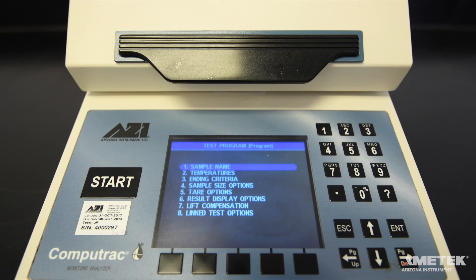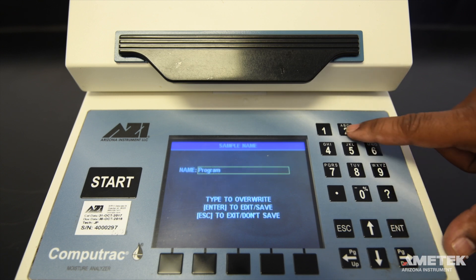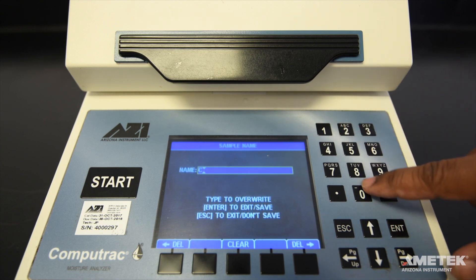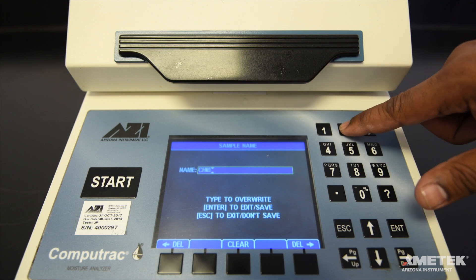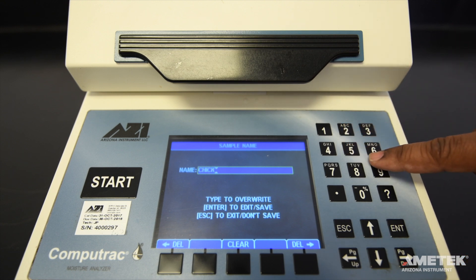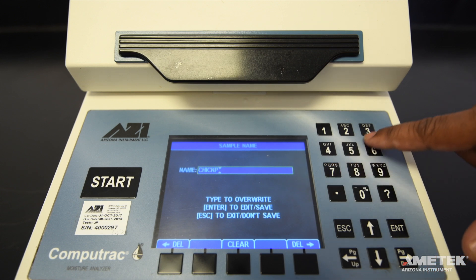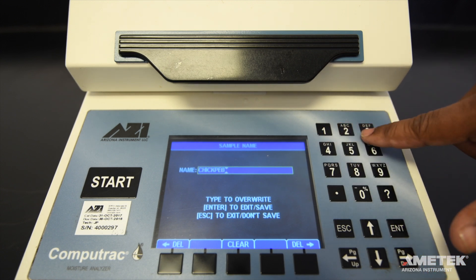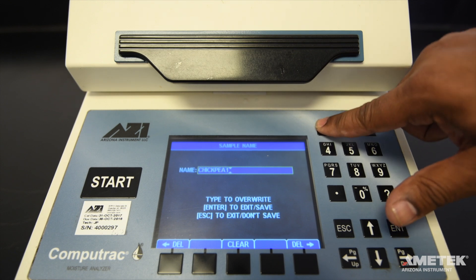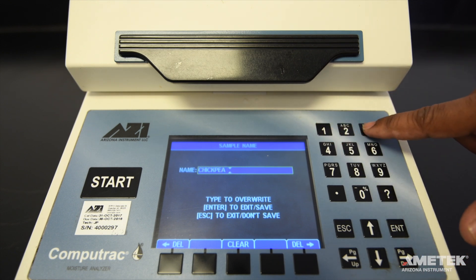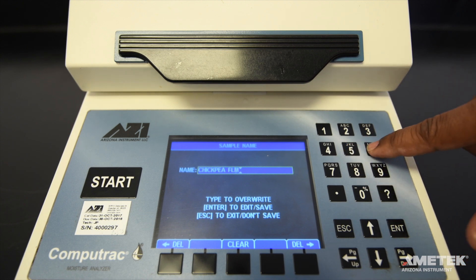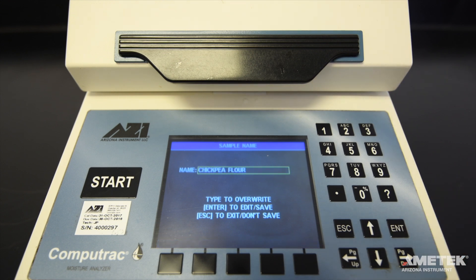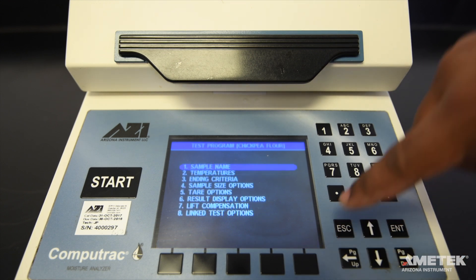There are eight sets of test parameters for each program. To edit the sample name, press enter when sample name is highlighted. Use the arrow keys to navigate to the sample name field and press enter to begin editing. Type in the sample name using the number keys. To insert a space, press the number 1 twice. You can use a product name or number — anything that will help you identify the test in the program list. Press enter to save the program name, then press escape to return to the previous menu.